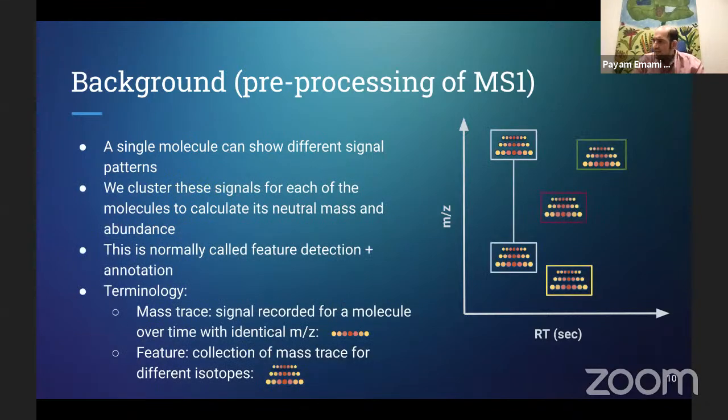What I often say is that the mass spectrometry process is a world of clustering. We do a lot of clustering in order to group together the ions that we think are coming from the same molecule. In this case, each box clusters the elution profile of one metabolite, including its isotope pattern. You can also do cross-box clustering, and that's for the adduct detection.